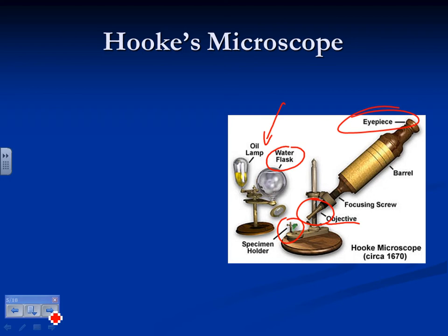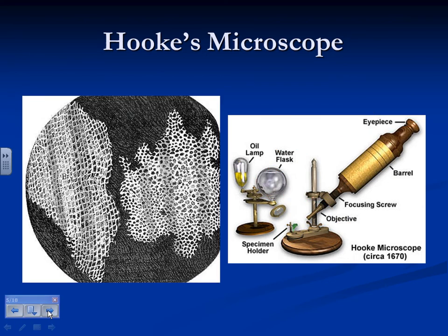So when the light goes through that, here's your flickering flame. When that light passes through that sphere of water, it actually focuses it on the specimen. Now, it's like taking a flashlight before flashlights. So we took a flashlight and we're putting it right on that because you can't see it without sufficient light. So the more light that bounces off into the microscope, the better.